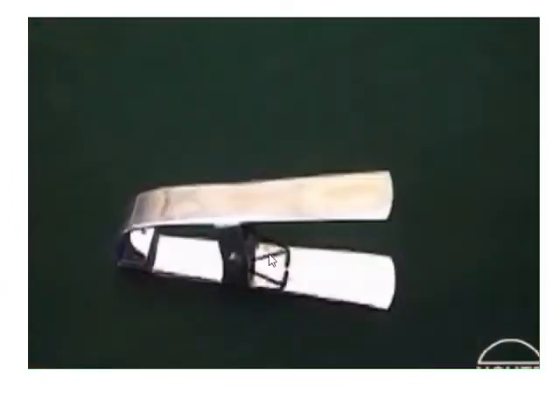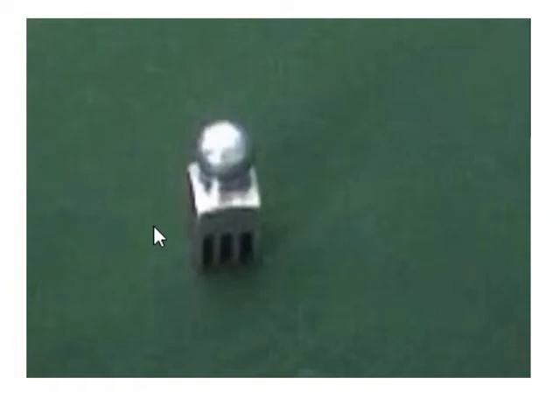This is a tweezer to pull the fibers and keep them in position. This is a depressor. You can see the grooves in the depressor. This is to position the fibers inside the combs. After using the tweezer, you place the fibers on the combs, and using the depressor, you press the fibers inside.